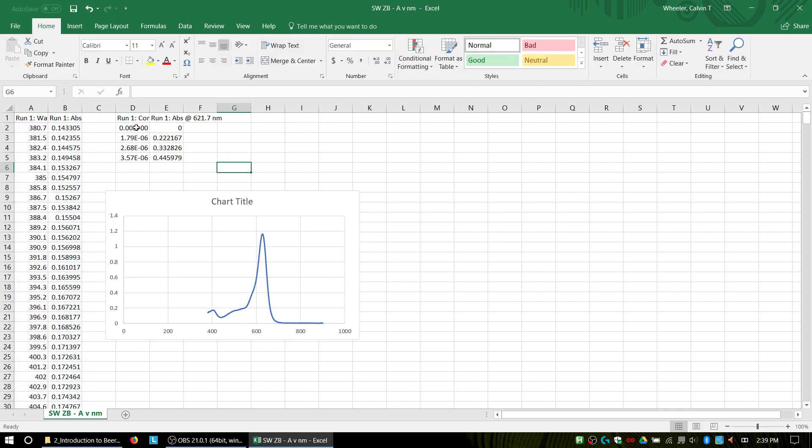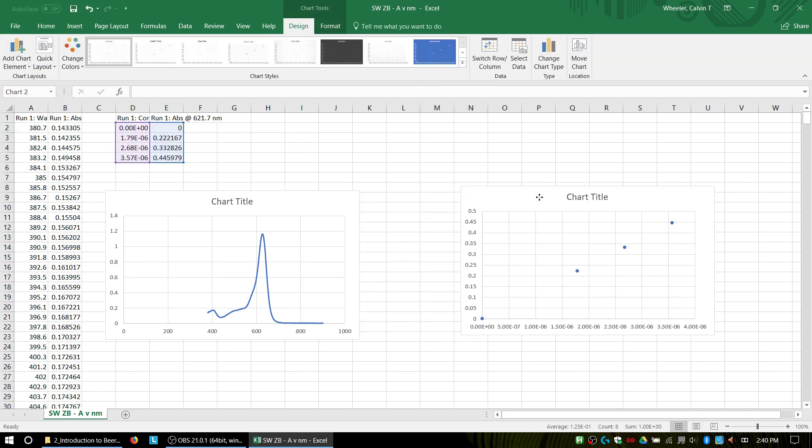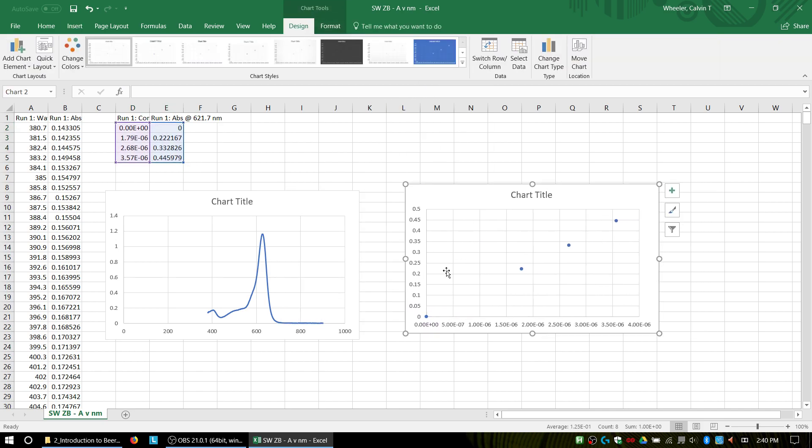My other one is going to be from my calibration plot, so select that data, go to Insert, and this one I want to be a scatter plot. So there I have my two raw charts.